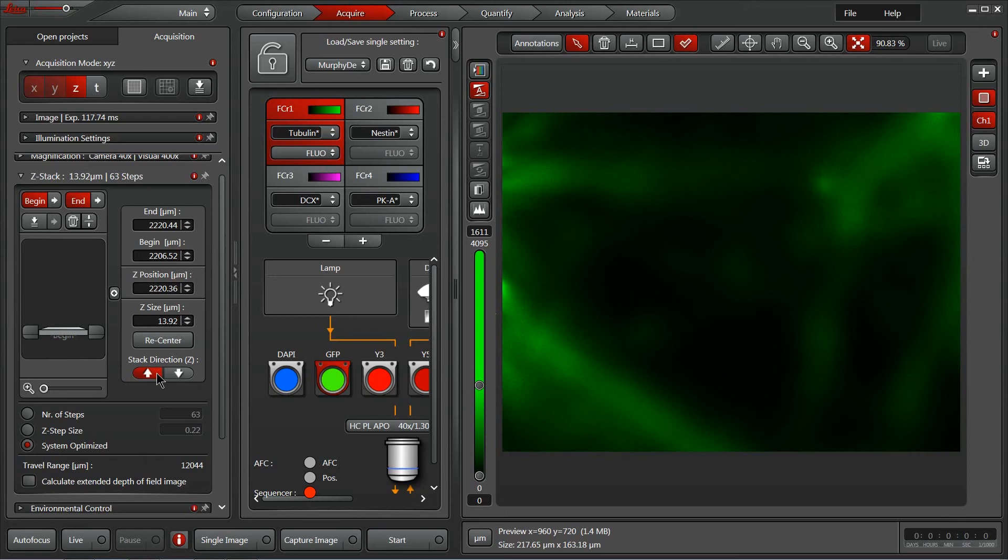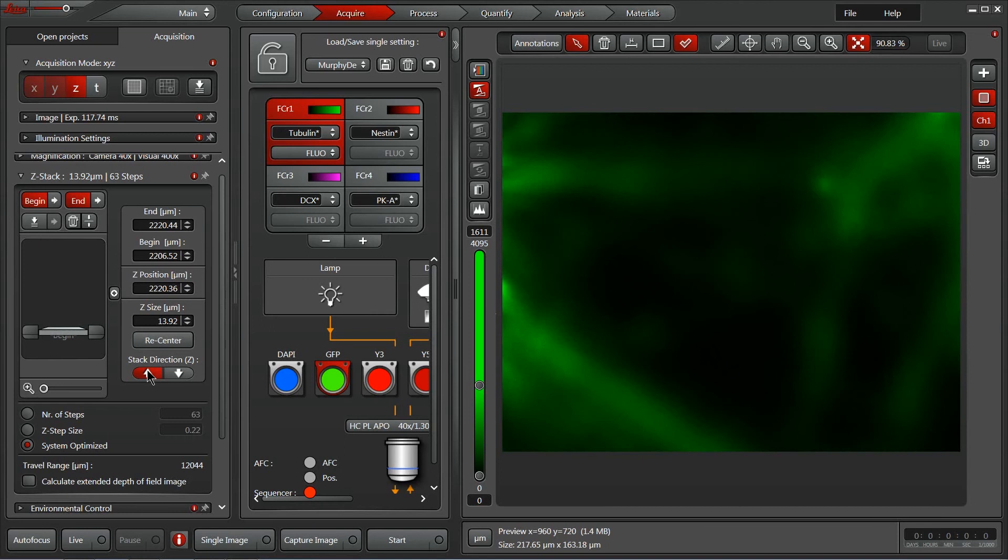You can control which direction the acquisition happens. I always prefer, especially with these nice thick slices like this, to image from the furthest point away from the objective towards me so that I get the highest number of photons as possible from the farthest or deepest part of the sample.